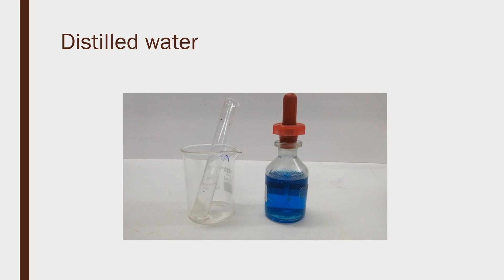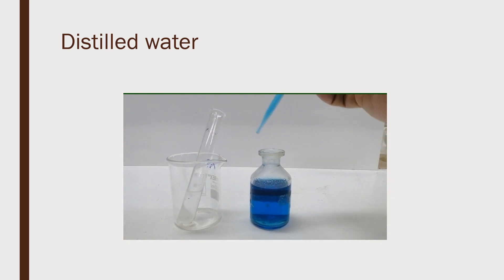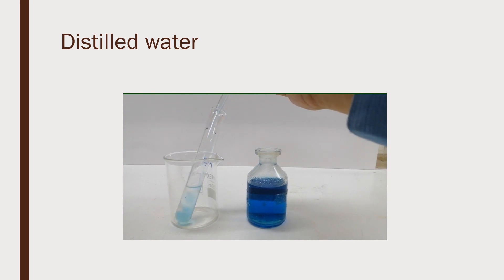Let us first use distilled water as the test sample. We add the same volume of Benedict's solution into the distilled water. The distilled water turns blue.